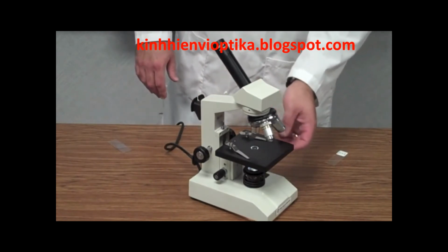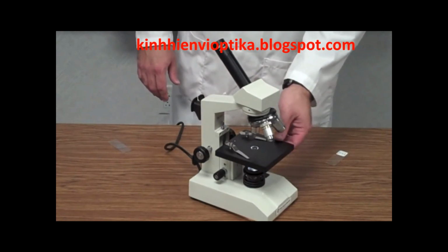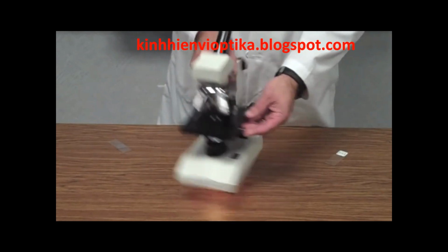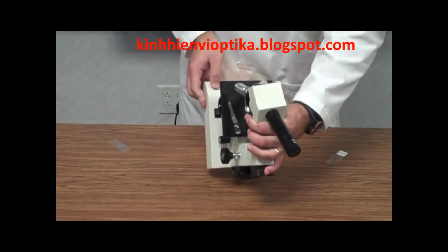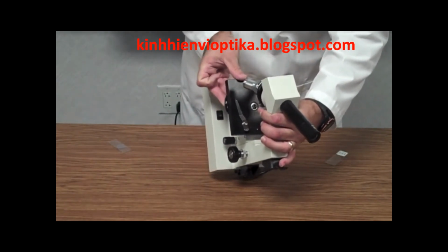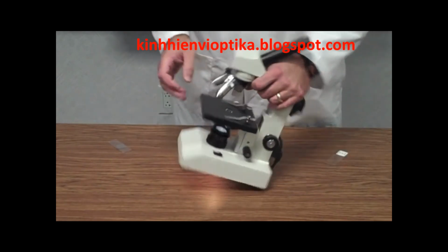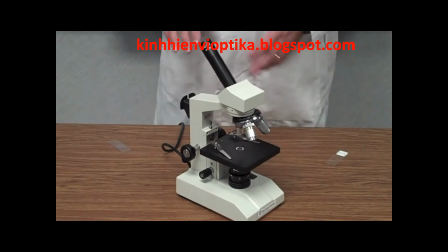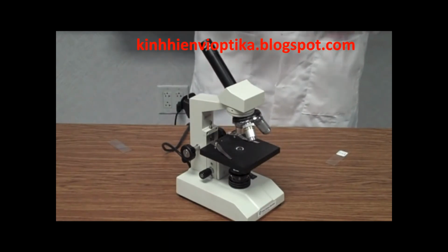The next thing is make sure your diaphragm is on a medium number. I usually like to start on 2 or 3. Okay? And it has a number over here to the side, okay, that tells you what the number is, whether it is 2 or 3 or 4. So we'll start right here on 3. Okay? Again, make sure you're not between holes in the diaphragm either, because if you're between holes in the diaphragm, it won't allow light to shine through the stage.